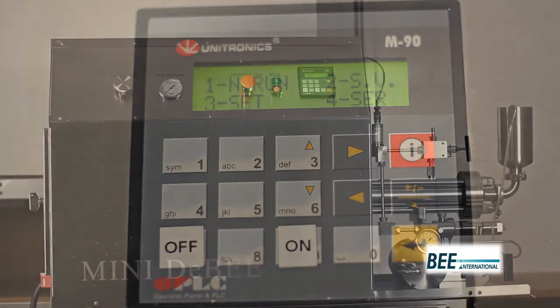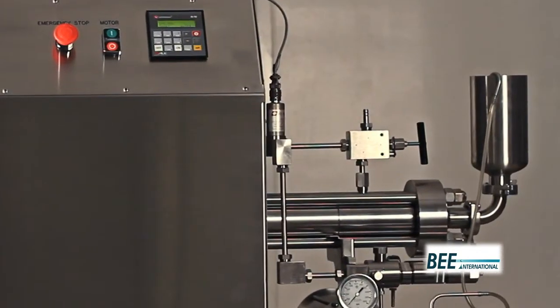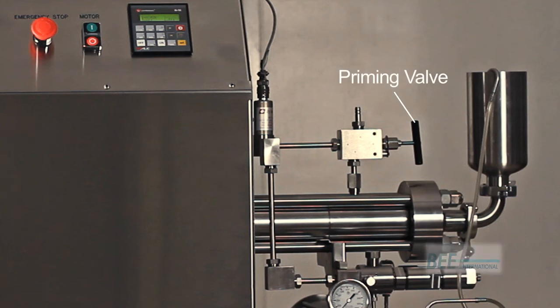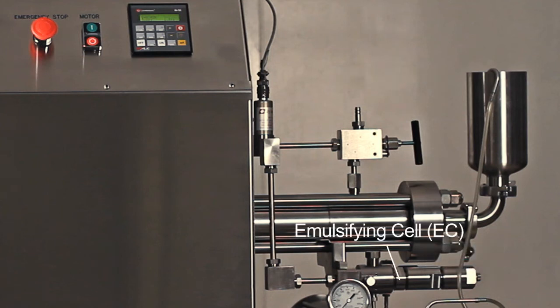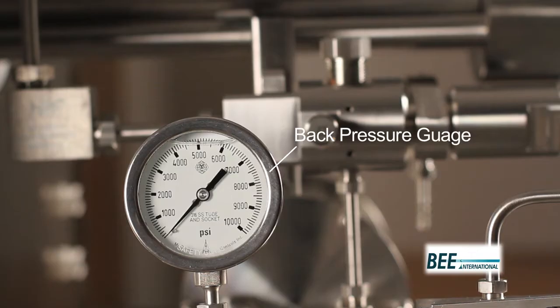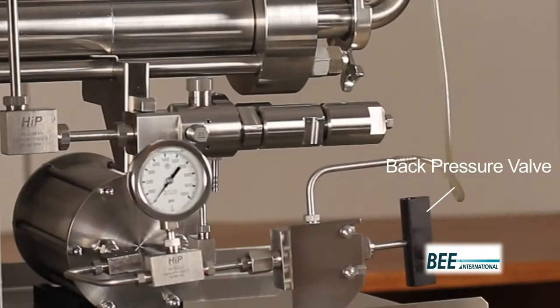On the processing side we have the inlet reservoir, the intensifier, the priming valve, the emulsifying cell or EC, the heat exchanger, the back pressure gauge, and the back pressure valve.